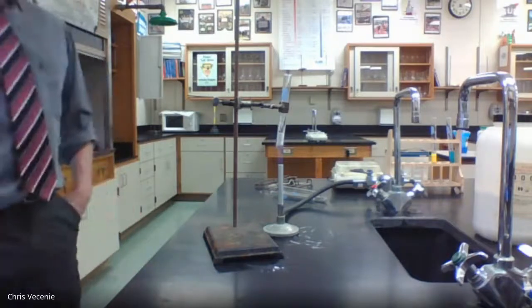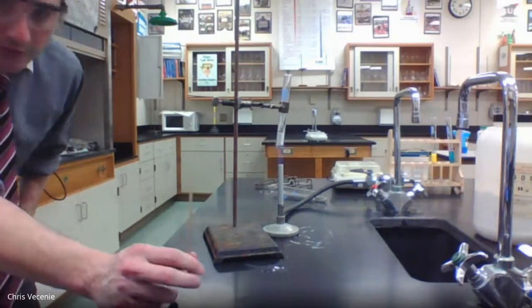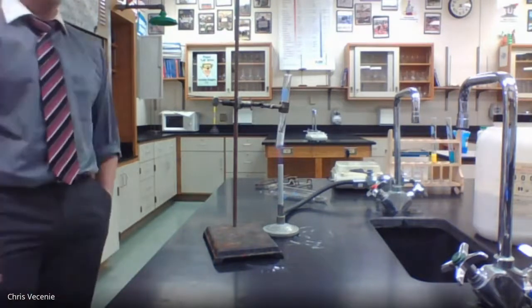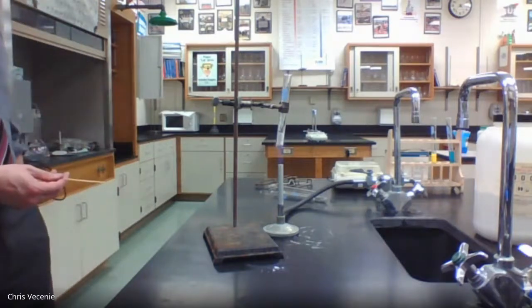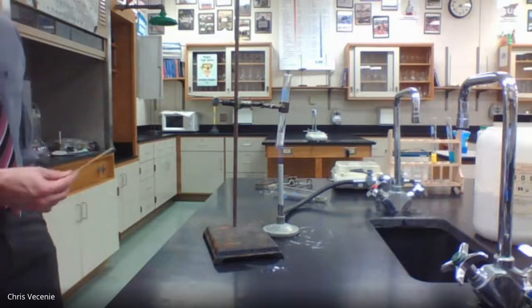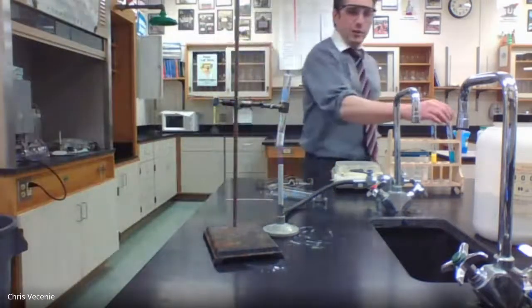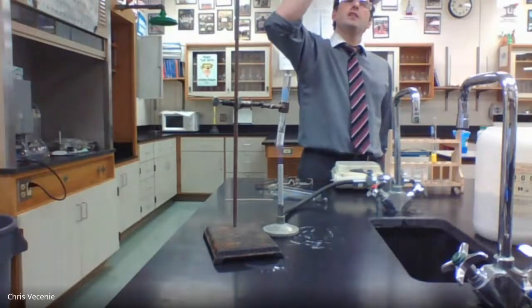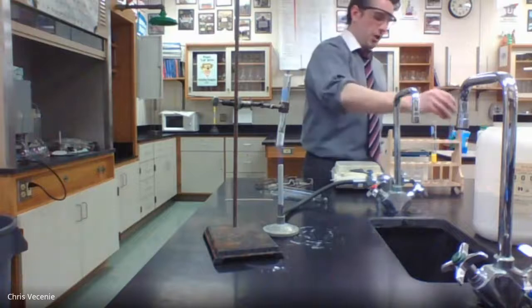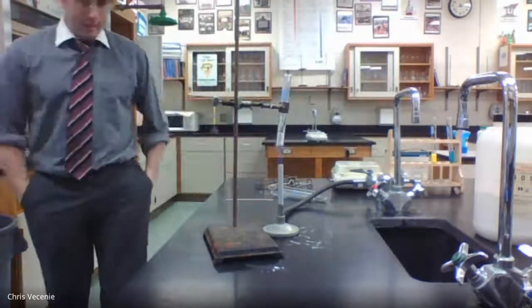So I'm going to take a look at the clock right now when I'm doing the experiment. I've got it at 4:38. So at 4:43, I am going to test this, because sometimes reactions take some time to occur. In the meantime, I'm going to take a little peek at our first reaction. And I'm going to let that keep going just a little bit more so you guys can get a good look about what's happening.